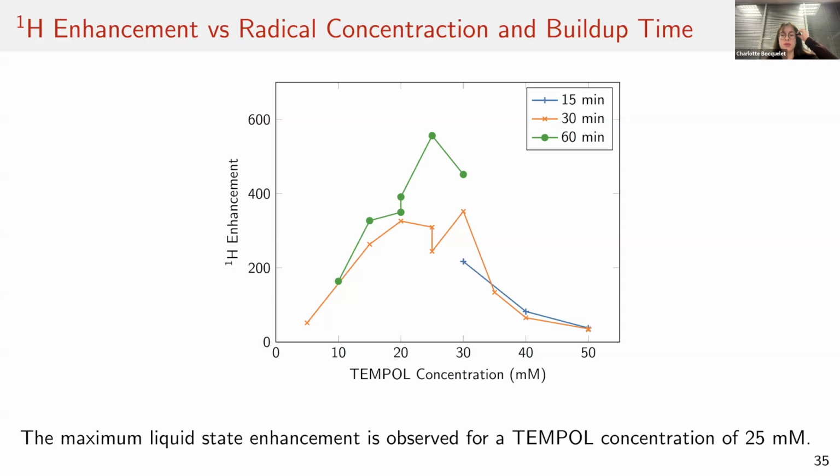And related also to the transfer, how much polarization is lost as a function of concentration during the transfer in the channel? Do you have a value? Okay, so I think if we have now a proton enhancement of 2000, that I think translates to something like 8% or so of proton polarization.